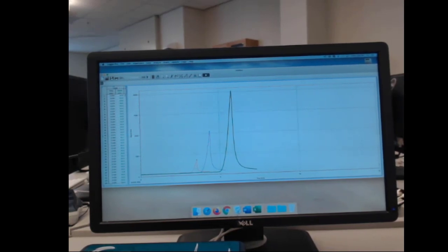As we consider more complicated mixtures of compounds, we'll see how a change in the molecular weight or the functional group can also influence this idea of retention time or the idea of boiling point.